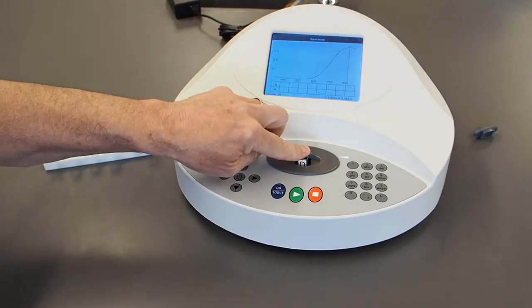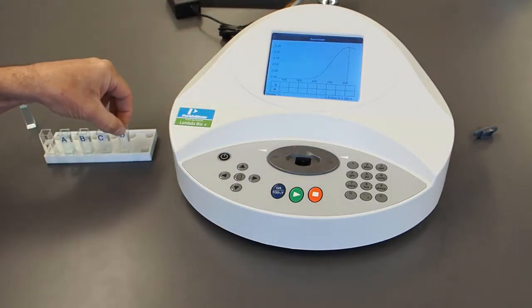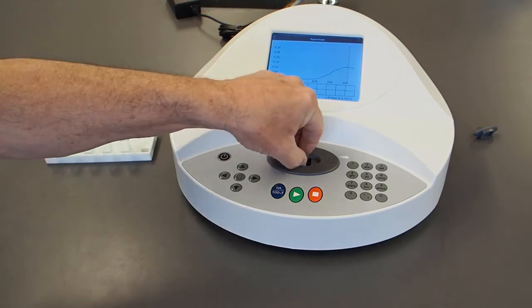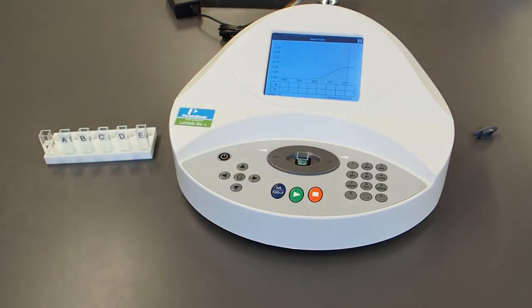Sample D, 0.266. And sample E, 0.137. And finally, we want to do our unknown solution, the solution of our unknown compound. The absorbance for that solution at that same wavelength is 0.544 absorbance units. All right, so that's all the measurements we're making.